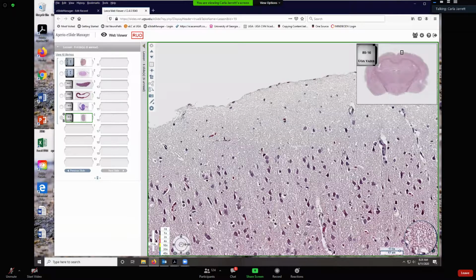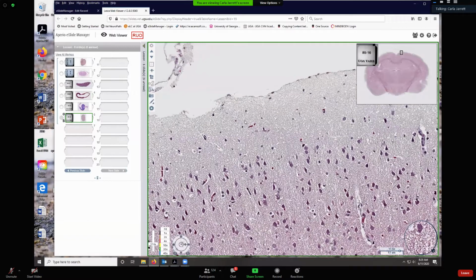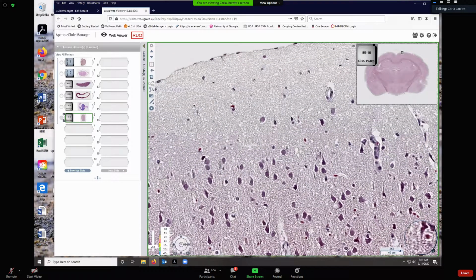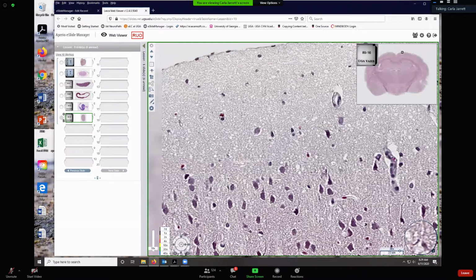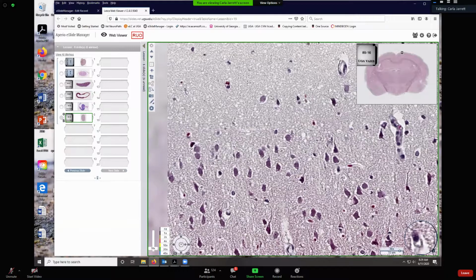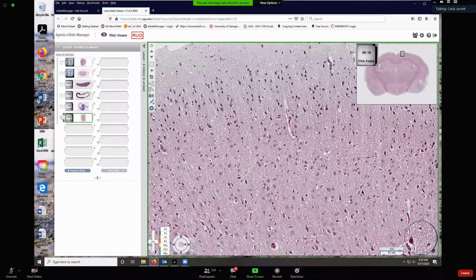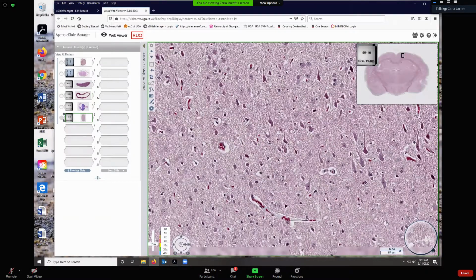So we're going to call this the molecular layer. We do want you to know that. That's the name of that outer layer that doesn't really have many neurons at all. It's got some blood vessels, tiny little blood vessels. Here's a vessel, here's a vessel. And it's really just got nuclei of support cells, those glial cells, okay? So that's the molecular layer. And the rest are all these different neuronal layers that we're not going to distinguish and name.